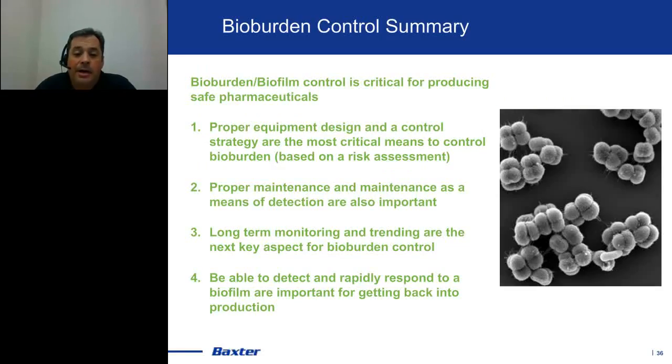So continuing down that summary, really for the pharmaceutical industry, it's thinking about what your products are, designing effectively for those. So that's equipment design, your control strategies, so your processes, hopefully all based around a risk assessment. Then I highly recommend good maintenance programs and using that maintenance program to do microbial inspections as well. Really looking at your long-term monitoring and trending for your bioburden. And then if you do detect an issue, being ready to rapidly treat that.